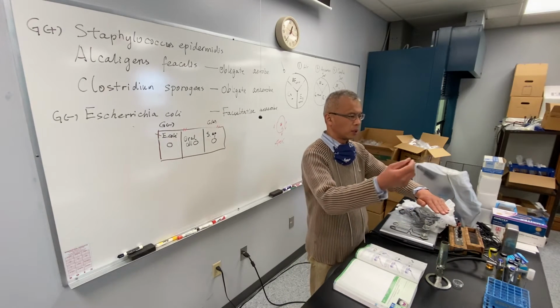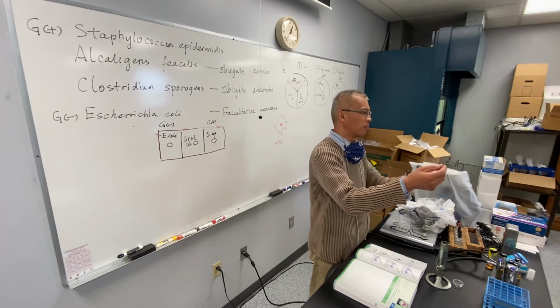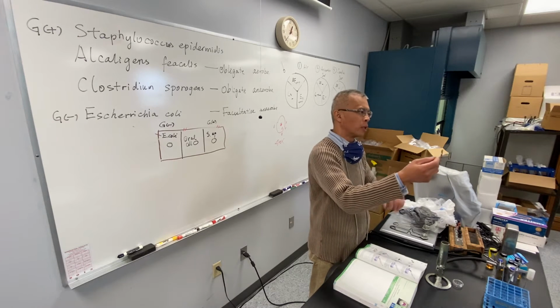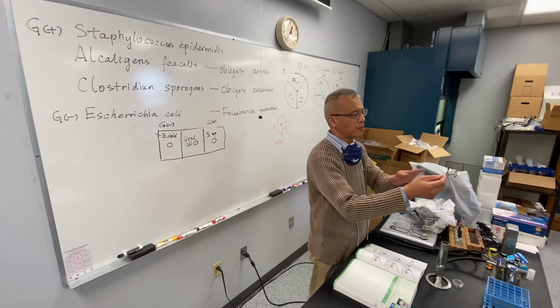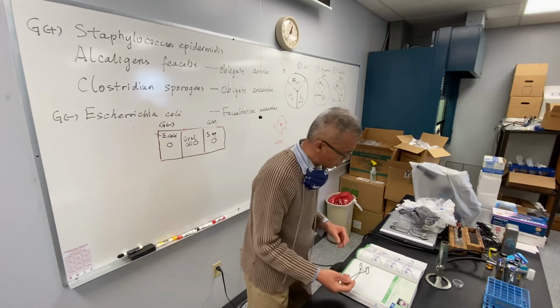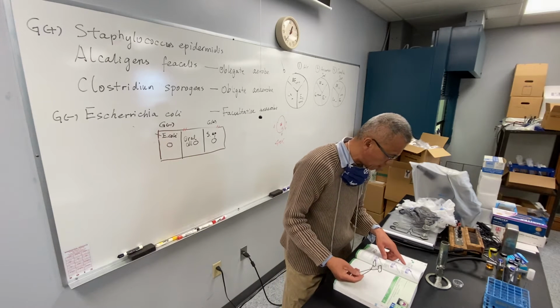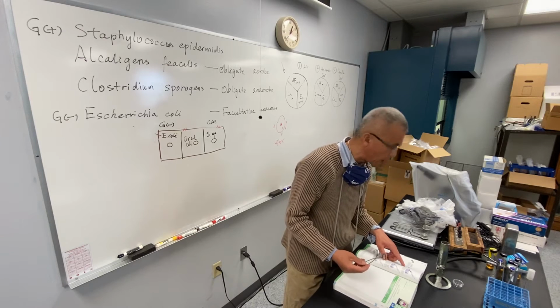And then you're going to dry it over a flame. Hold it a little bit higher. I don't want you to overheat, overcook, I don't want you to barbecue yourself, right? You want to heat it until you see the water is gone, evaporated, and that's it. Never overheat.